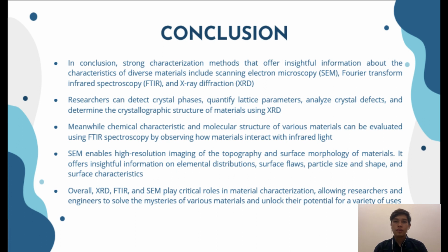spectroscopy by observing how materials interact with infrared light. SEM enables high resolution imaging of the topography and surface morphology of materials. It offers insightful information on elemental distribution, surface flaws, particle size and shape, and surface characteristics.